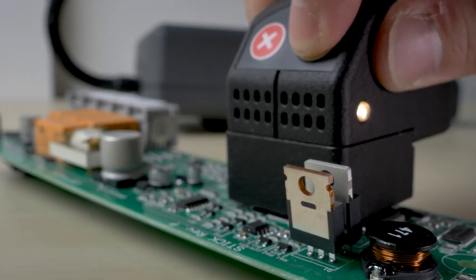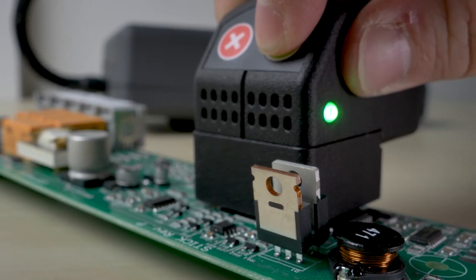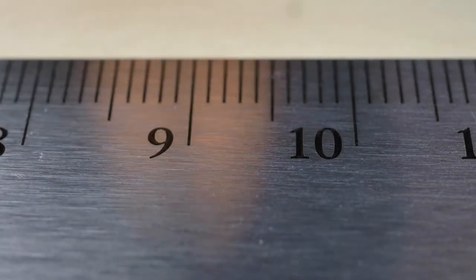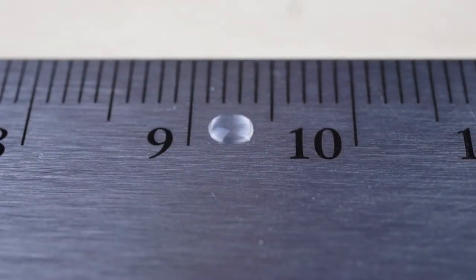Eliminate scrap resulting from destructive testing. The 5001 takes inspections using tiny droplets of highly purified HPLC-grade water, eliminating the potential for material contamination and makes inspections completely harmless to users.